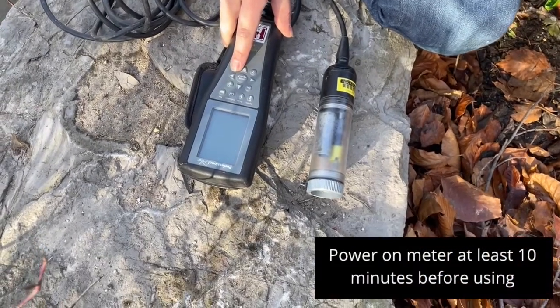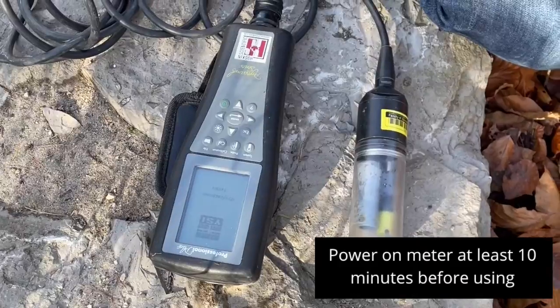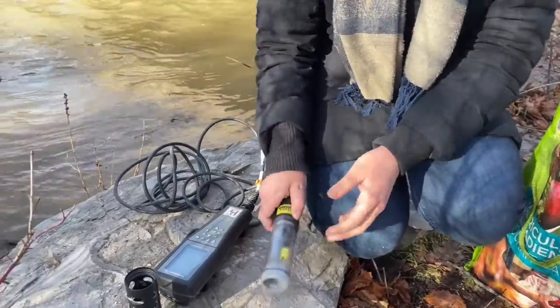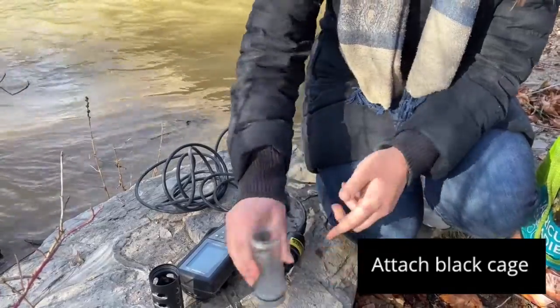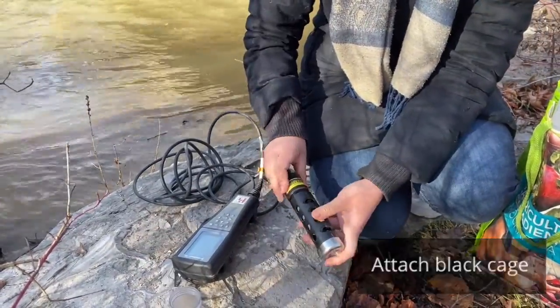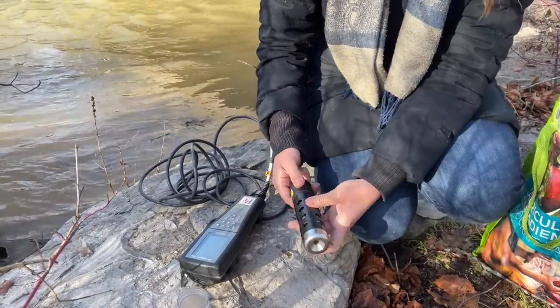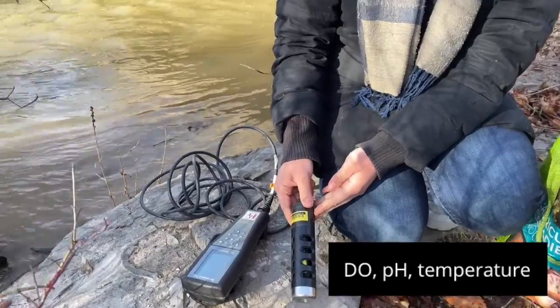Start by powering on the YSI multimeter and make sure to do this 10 minutes beforehand so that it's warmed up. Then take off the protective plastic sleeve and attach the black cage. This prevents the expensive probes from being damaged in the water from grinding against the rocks or the substrate. The probes on the YSI multimeter measure dissolved oxygen, pH, and temperature.